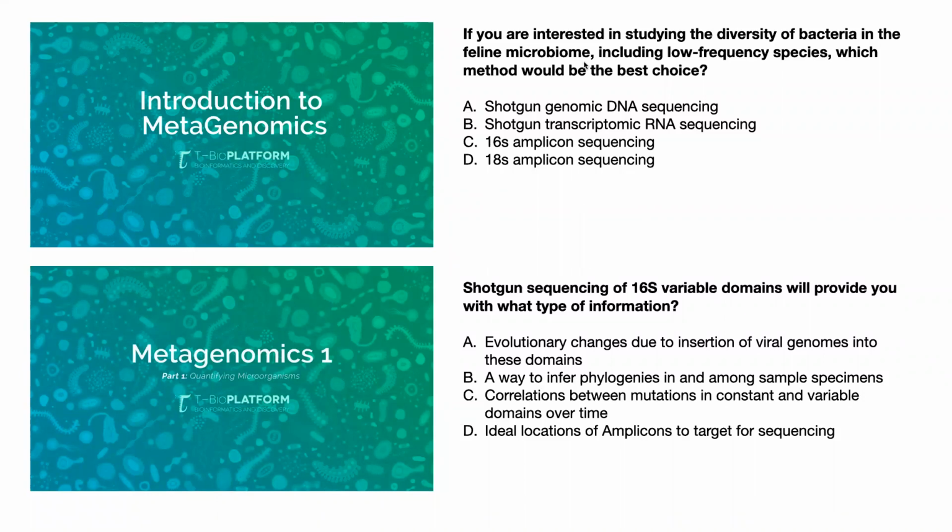And the reason for that is because the 16S amplicon sequencing allows us to study diversity among all or the majority of the microorganisms. So look, we are looking here at diversity of bacteria. That's the goal. So we'll talk about what is 16S amplicon and what is this gene, 16S ribosomal RNA today.